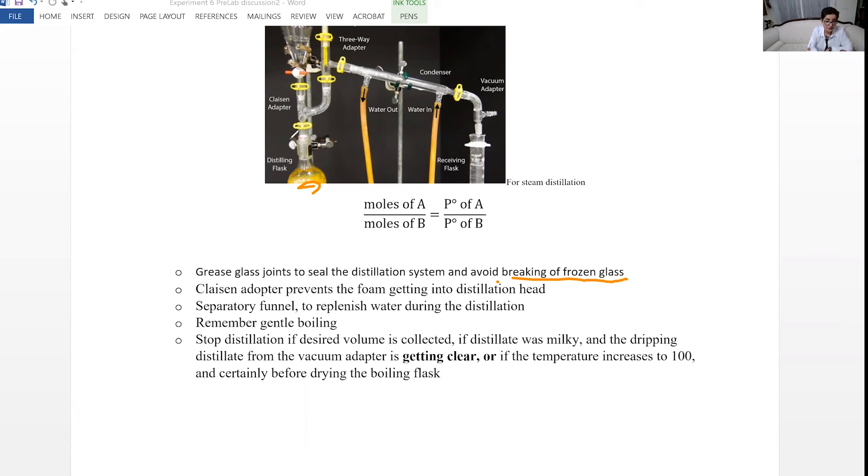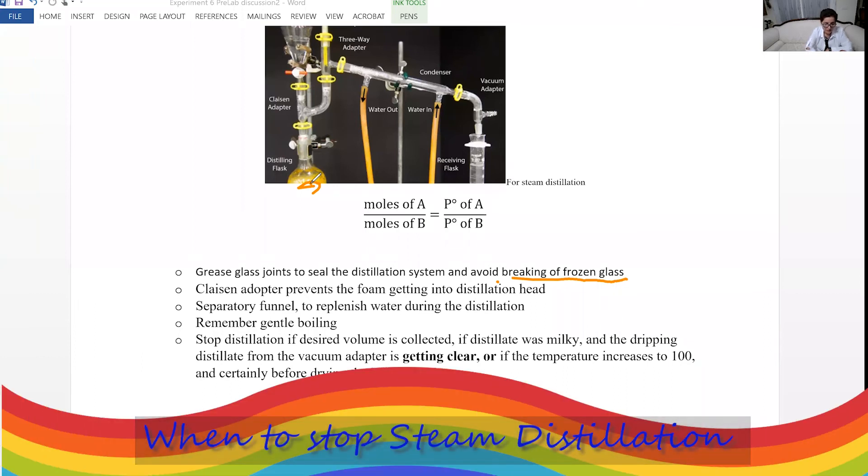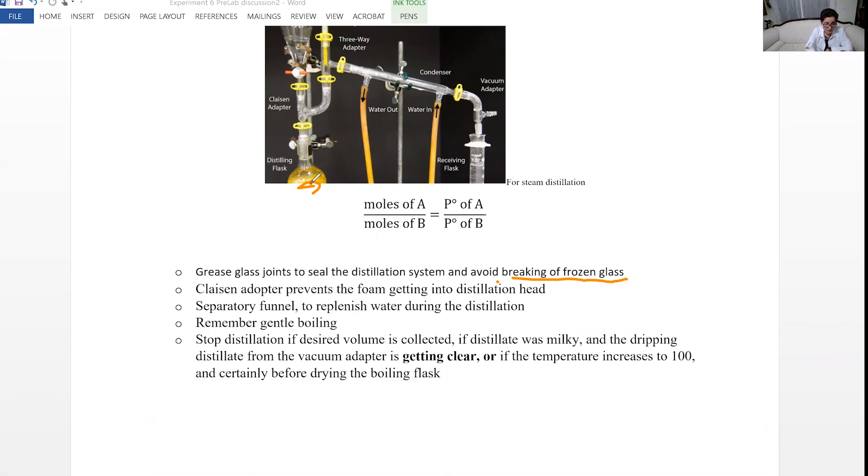If the water in the separatory funnel is finished and this is drying out, stop the heat right away. What does stopping heat mean? You turn off the power regulator, lower the heating mantle, remove the heating mantle right away. Because heating mantle is hot, just turning off the power regulator doesn't stop the heat. So you have to remove the heating mantle.